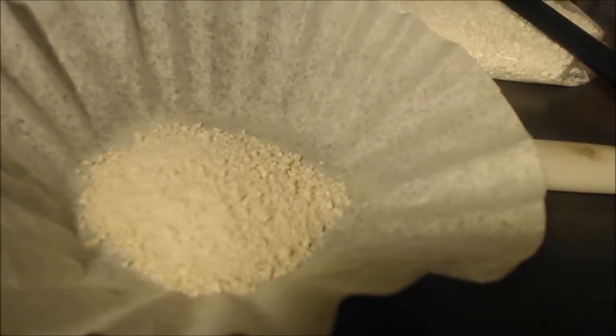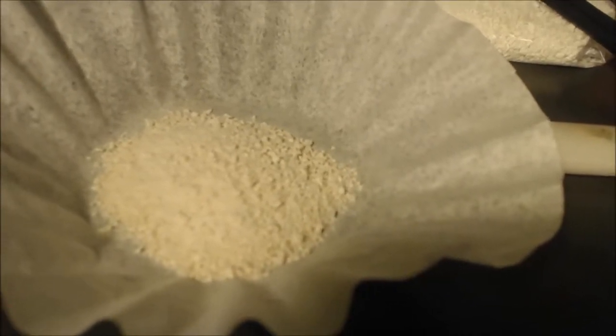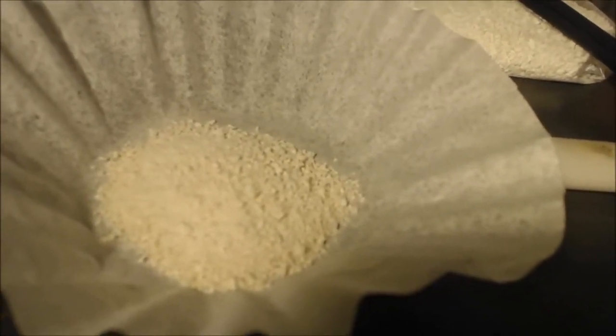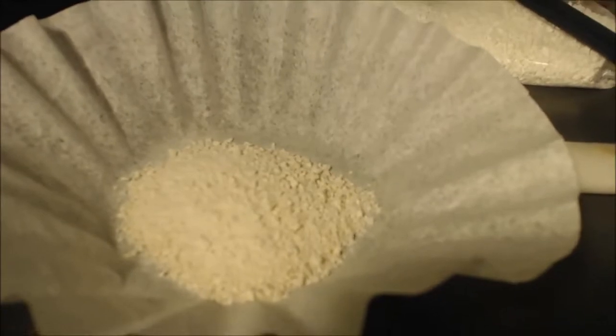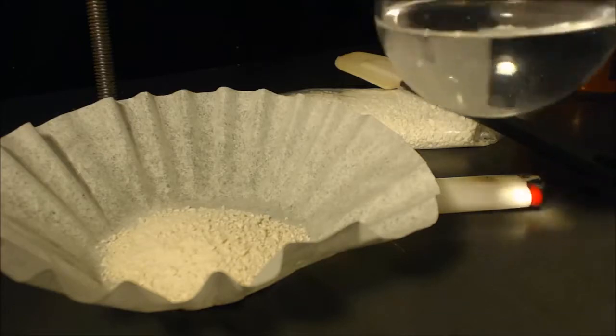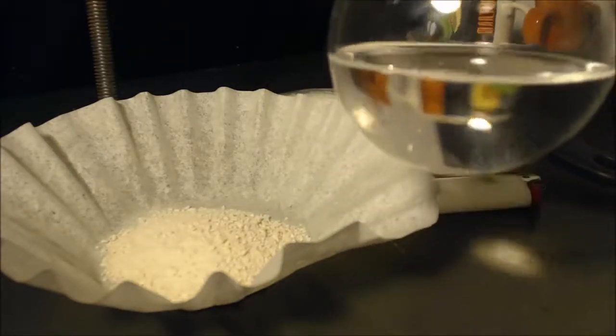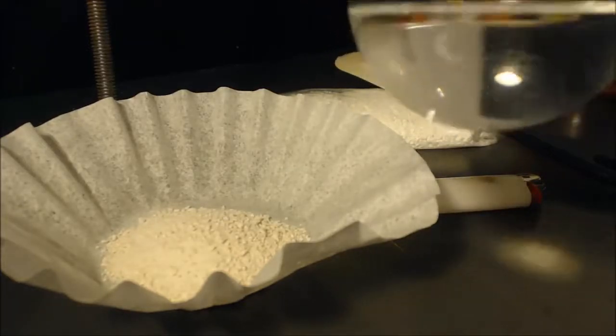So when I do this, put it in the ethanol, the anhydrous ethanol, it will dissolve all, to be pure. Won't be as much, but it'll at least be pure. The problem is I only have 100 milliliters of dry ethanol, and you can see there's still no 2 layers formed.